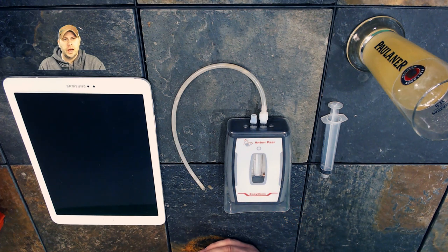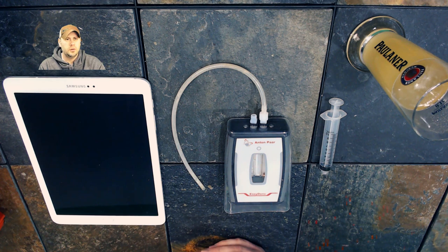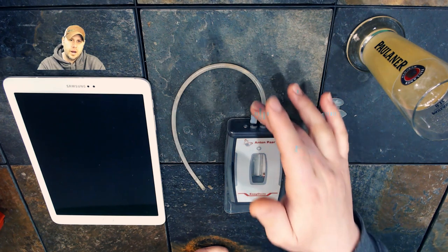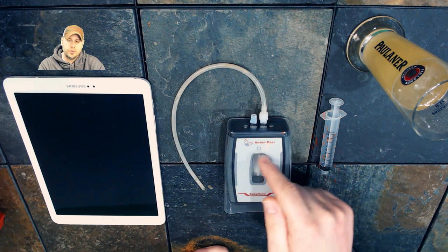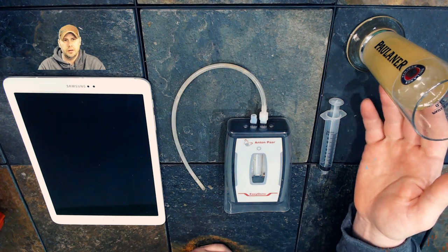How does it work? You use a syringe, you fill the syringe with a few milliliters of solution — whether it be a sugar water, wort, wine, or anything else you want to measure the gravity of — and you then connect that right here, push the sample through this density meter, and you will get an almost near-instant reading that is digital and very, very accurate.